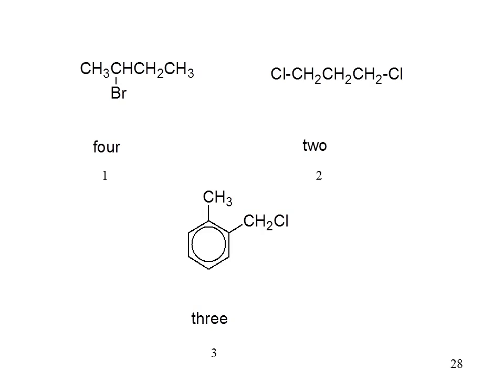so there are 2 types of non-equivalent protons in this compound. Compound 3 shows 3 different types of proton: one linked directly to the aromatic ring, the other linked to the carbon of the methyl, and a third proton linked to the carbon carrying chloride.